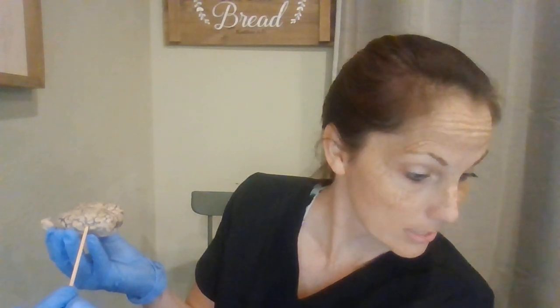And you have the lobes of the sheep brain, and it is the frontal lobe. And then you have the parietal lobe, which is the top of the brain. And then you have the occipital lobe and the side lobes, which always gets me. I'm going to have to look at this one.